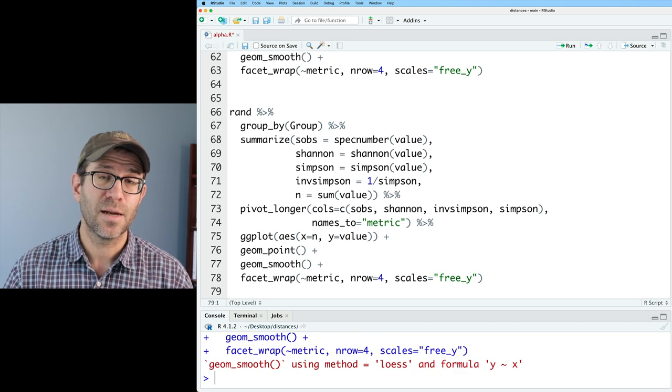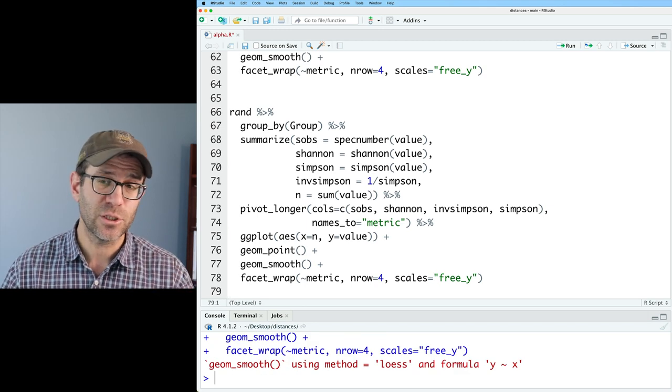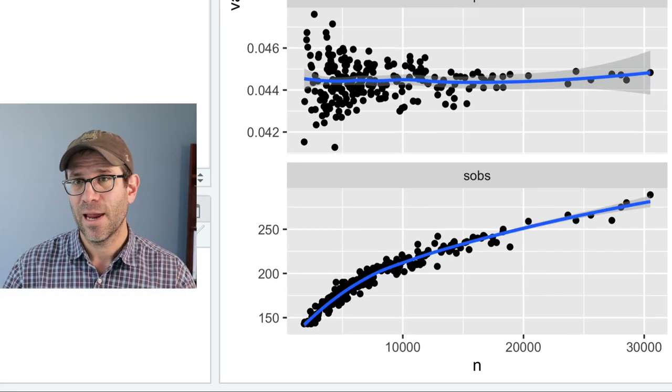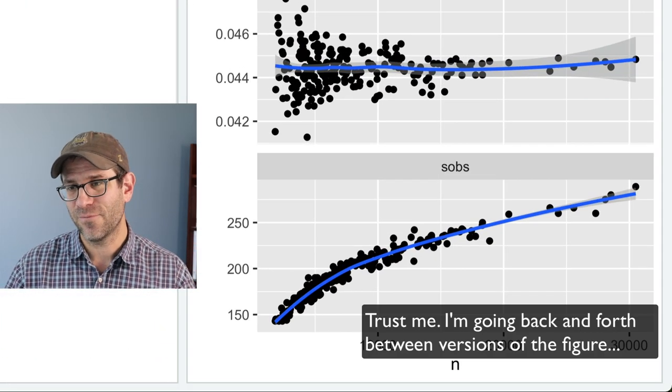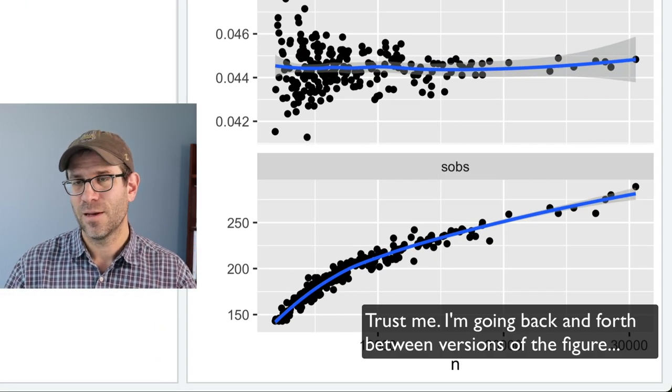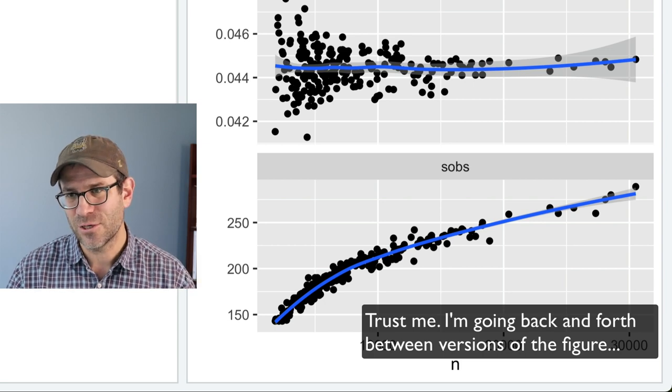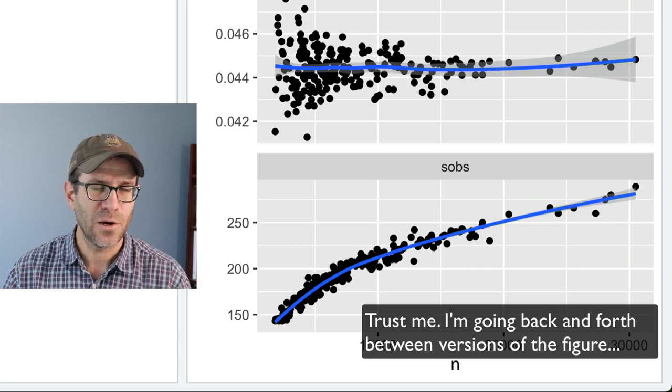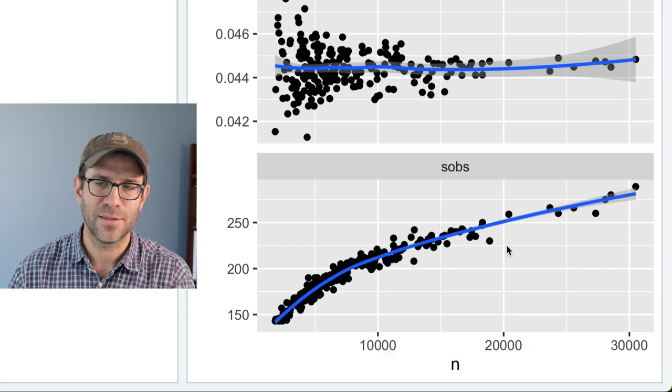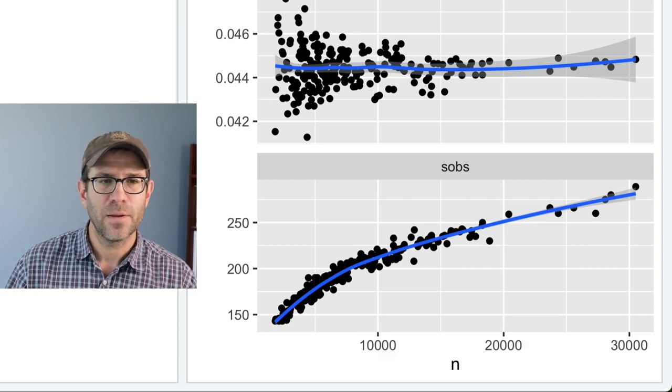So the first would be richness and so this would then be spec number. So spec number returns the richness of a community. As I toggle back and forth between that my version and the current version, we see no difference in the richness.